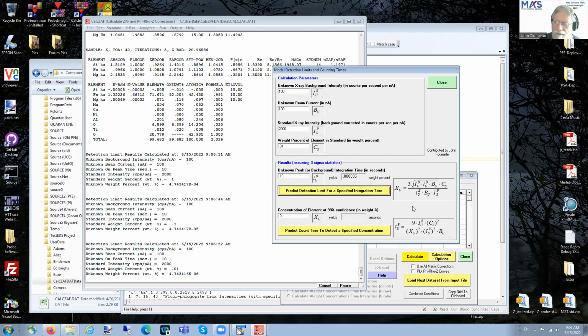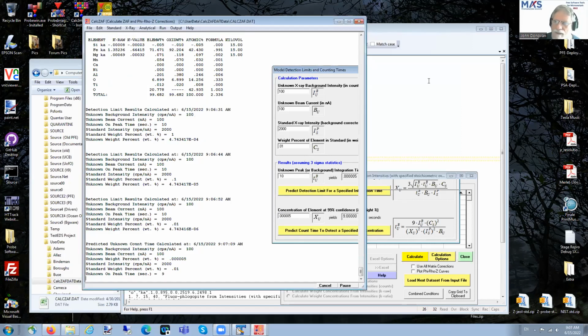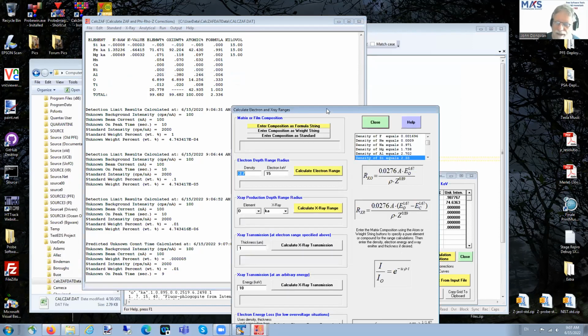There you go. And then this is the concentration. You can put in the concentration instead to try to get the same number back out. And if I count my zeros right, should get about the same number. And it's close, 10 seconds. Okay, so there's that.